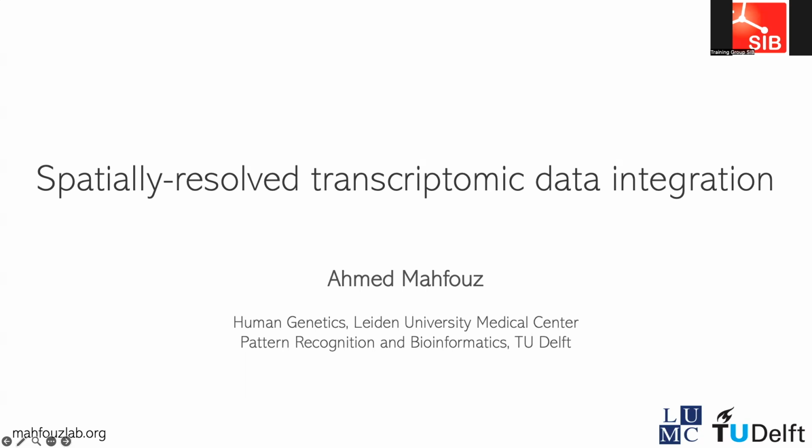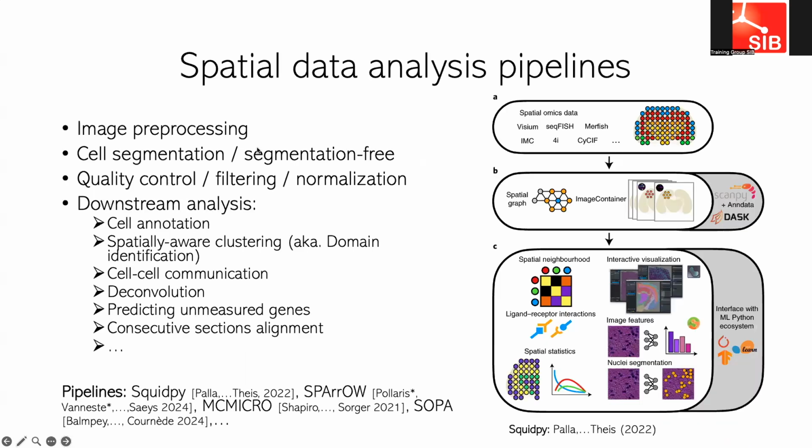Okay, then we start. So the last lecture of today is on data integration of spatial data. Just to make sure that we are all on the same page, if you're doing analysis, what we have covered so far is a little bit on the image processing or pre-processing of the data, a bit on QC, and normalization, filtering, and so on.